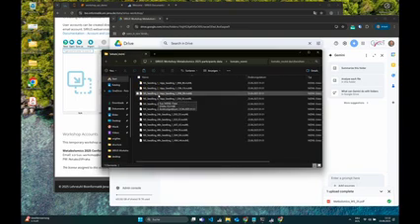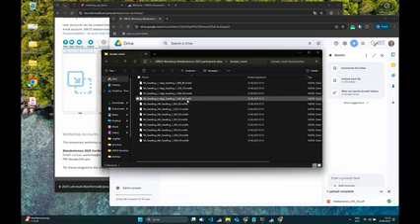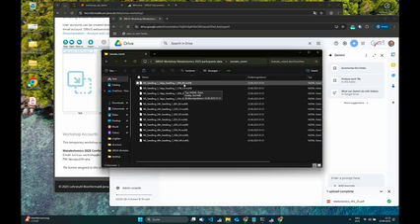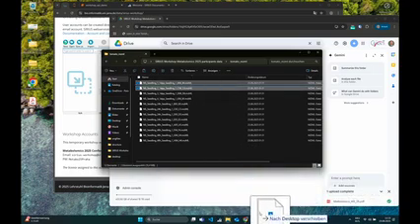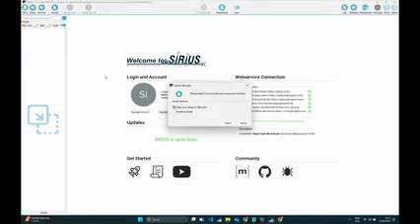And as Markus now said in the first part, if you want to import data, there are many formats possible for this. But if you load in full LCMS runs, the most probable format is probably MZML. And we now try to load in some data. For this, because it can take some time, this is all the preprocessing that Markus explained. Let's just select 2 of these MZMLs, and thus let's just drag them into SIRIUS. So you can simply drag and drop data into SIRIUS.